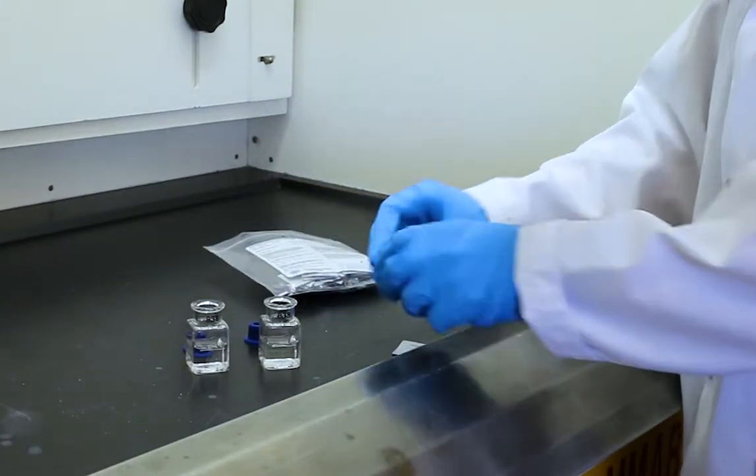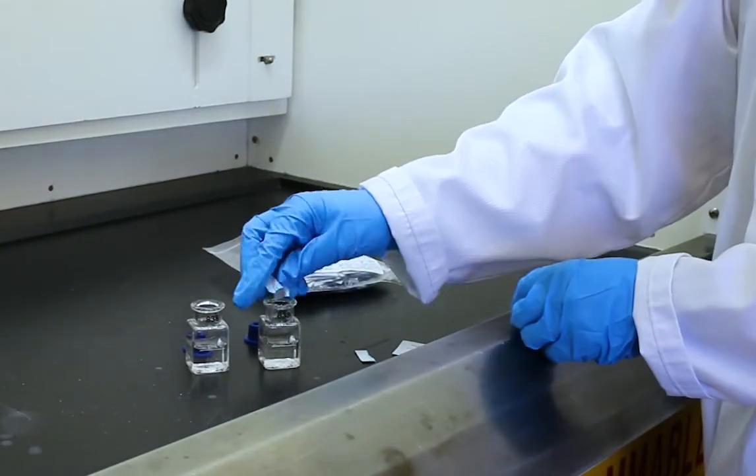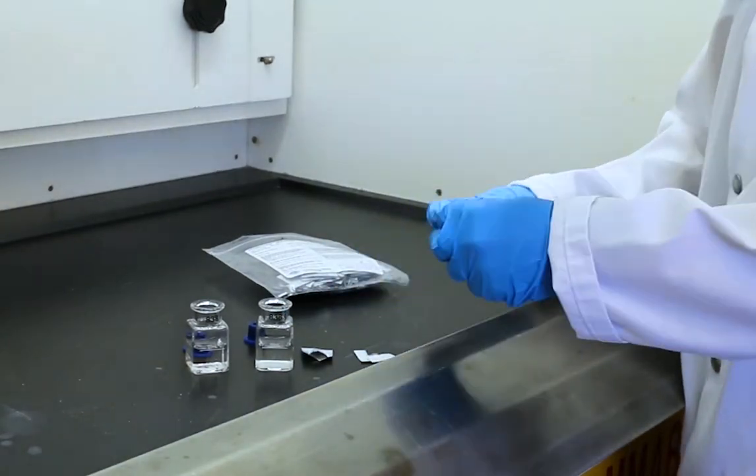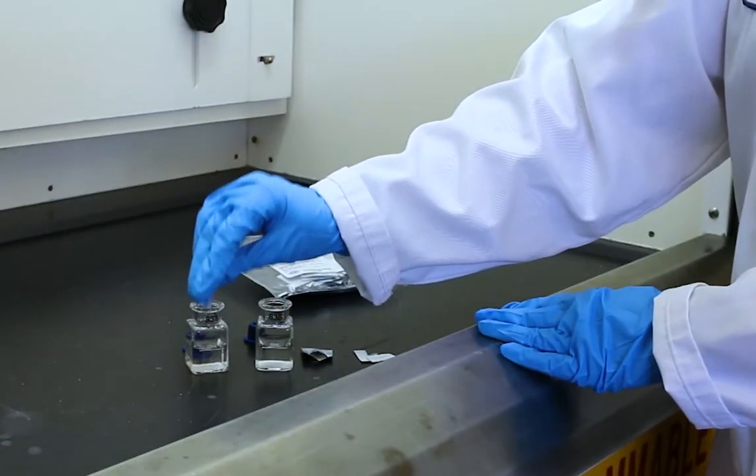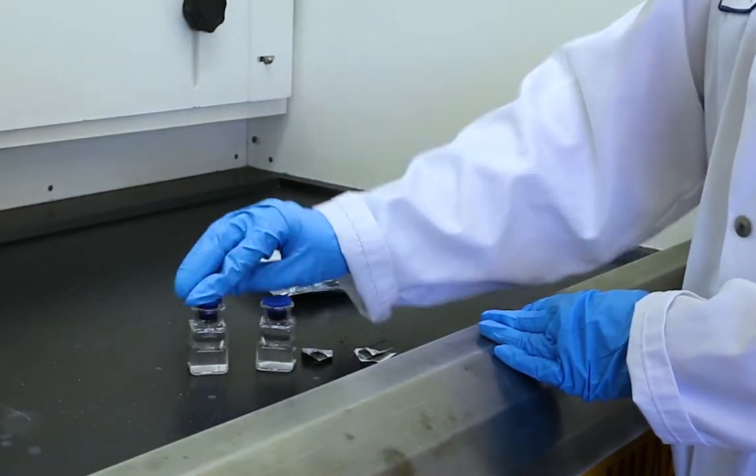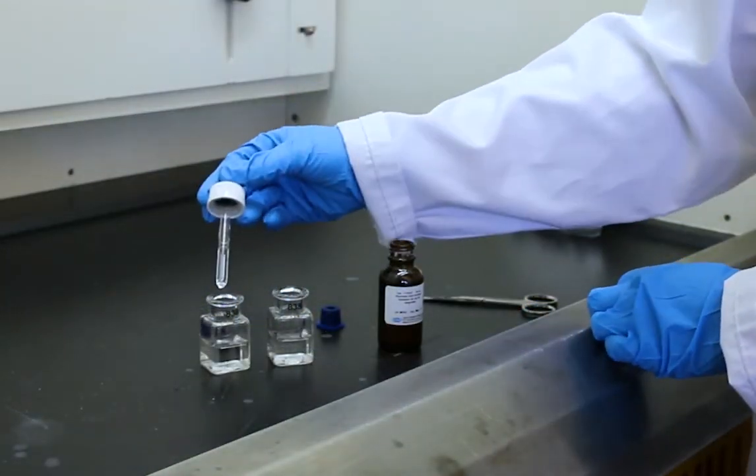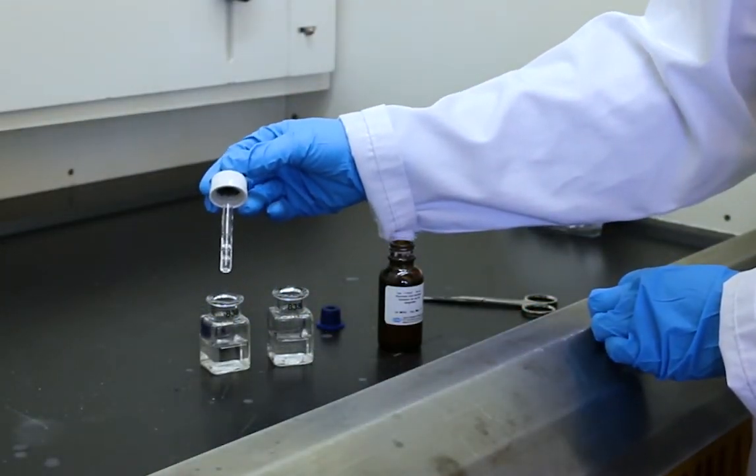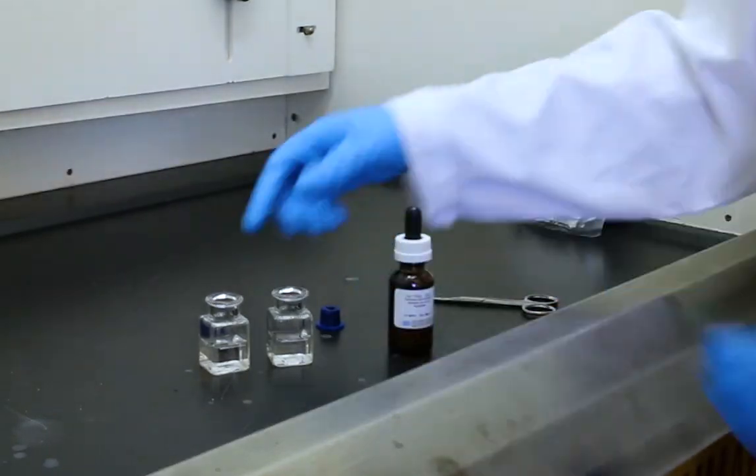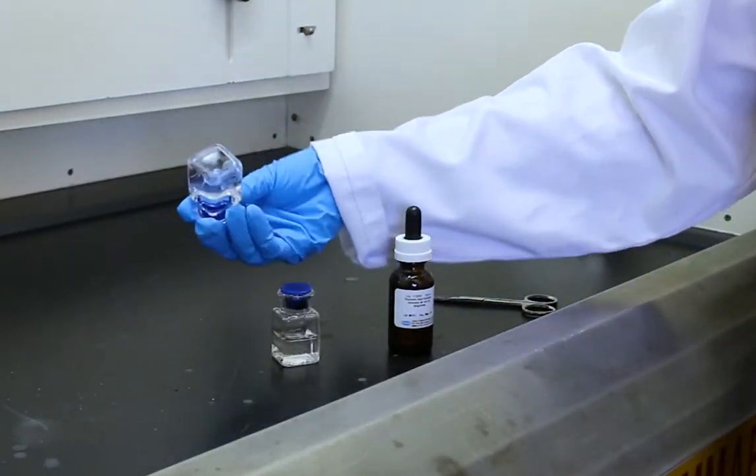Add the contents of one ascorbic acid reagent powder pillow into each cell and invert them to dissolve. If your water sample has hardness at interfering levels, add four drops of Rochelle salt solution to the sample cell after the ascorbic acid has been added.